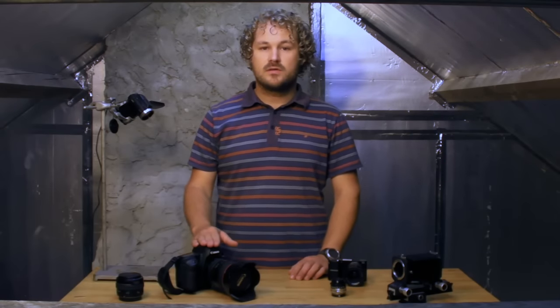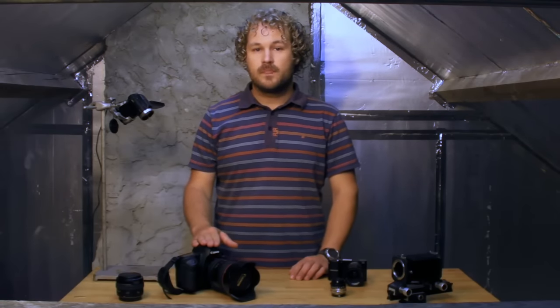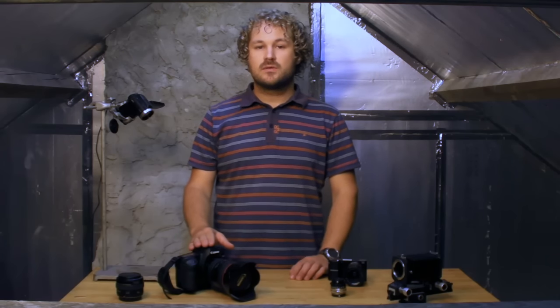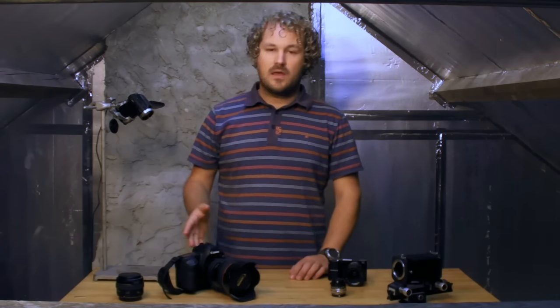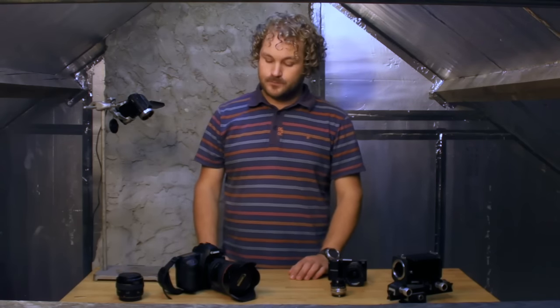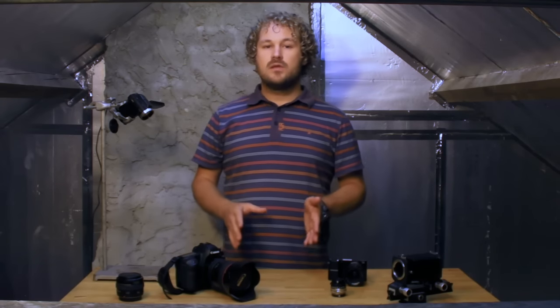Hi, I'm going to be showing you how you can use a normal digital camera as a powerful tool for measuring colour and pattern. Now it's important to realise that cameras were never designed as scientific instruments. They're designed for making pretty looking photos that look good to us on our computer screens or in print. So we need to be very careful in the way that we extract the photos and calibrate the photos so that we can use them for creating objective data.